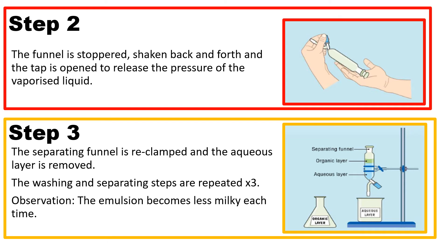Step two: the funnel is stoppered and shaken back and forth, then the tap is opened to release the pressure of vaporized liquid. Step three: the separating funnel is re-clamped using a retort stand and the aqueous bottom layer is allowed to flow into the beaker. As soon as the water level flows out, close the tap so the organic layer remains inside. The washing and separating steps are repeated three times; you'll notice the emulsion becomes less milky each time.